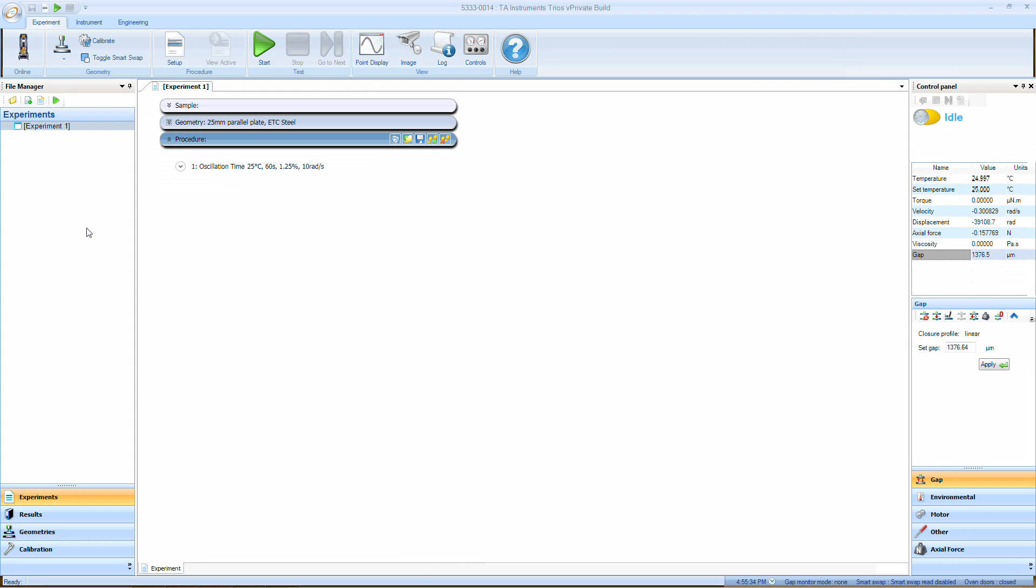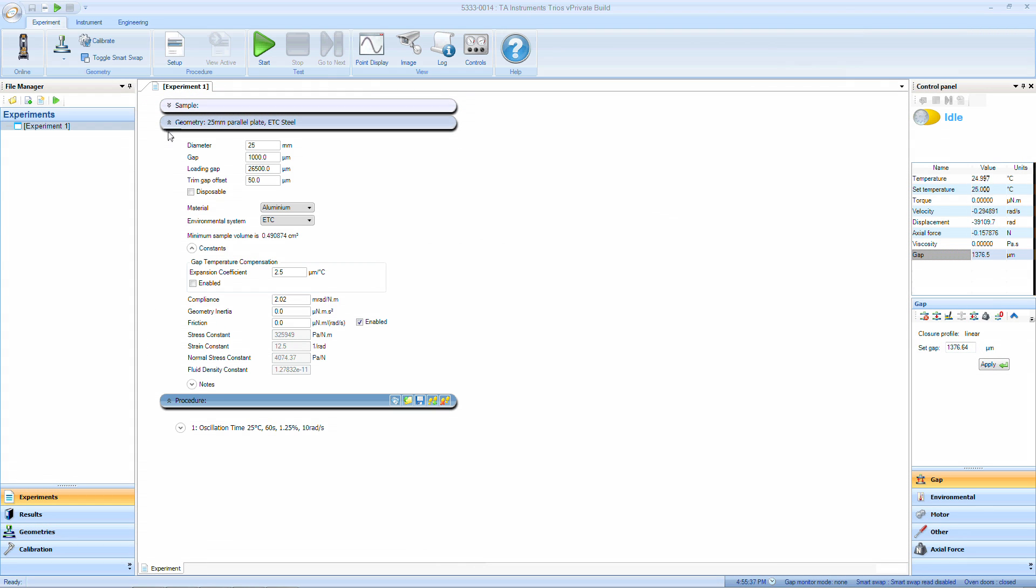When setting up an experiment from the setup window, under Geometry, the gap temperature compensation can be turned on or off as necessary.